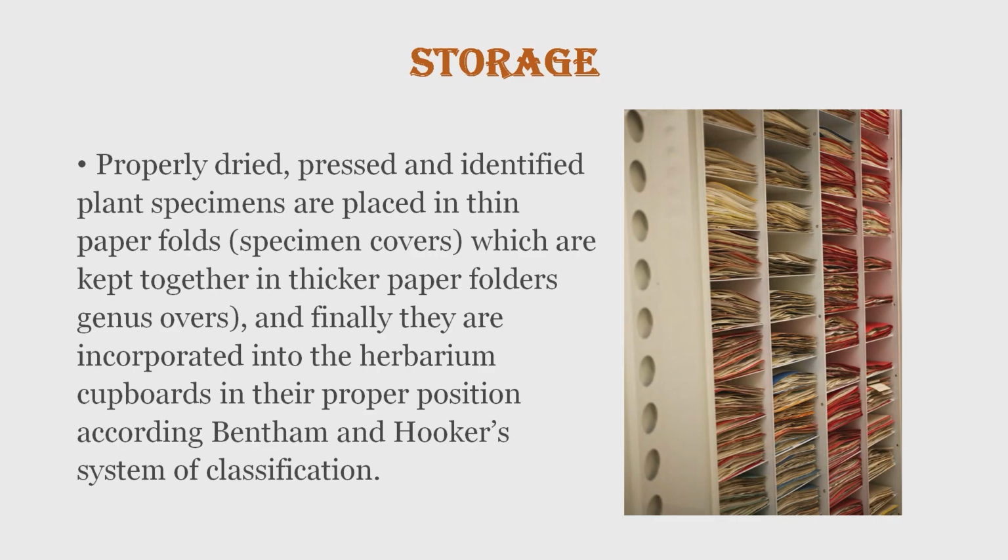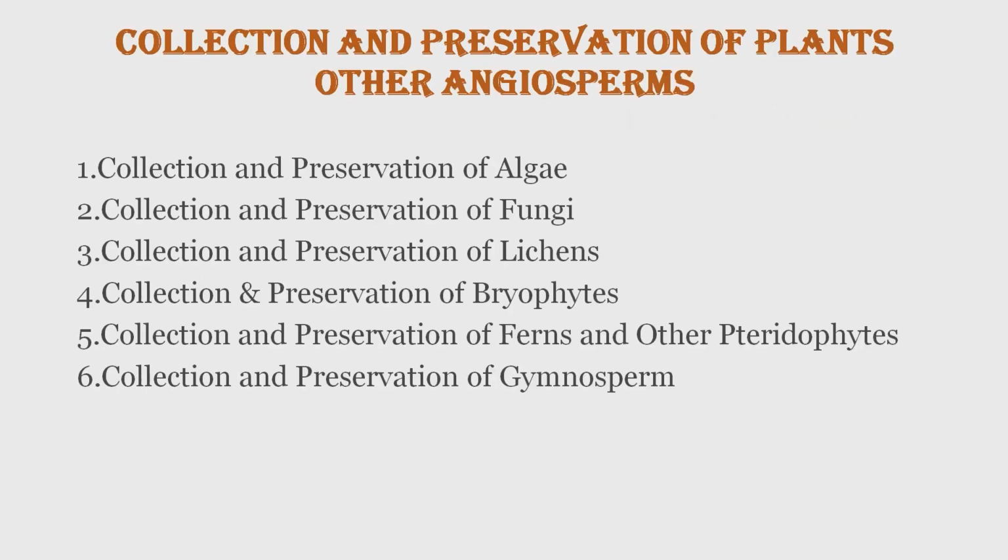They are kept together in thick paper folders, which is the genus cover, and finally they are incorporated into the herbarium cupboards in their proper position according to the Bentham and Hooker system of classification. You can see small shelves. Each and every shelf is called a pigeonhole.